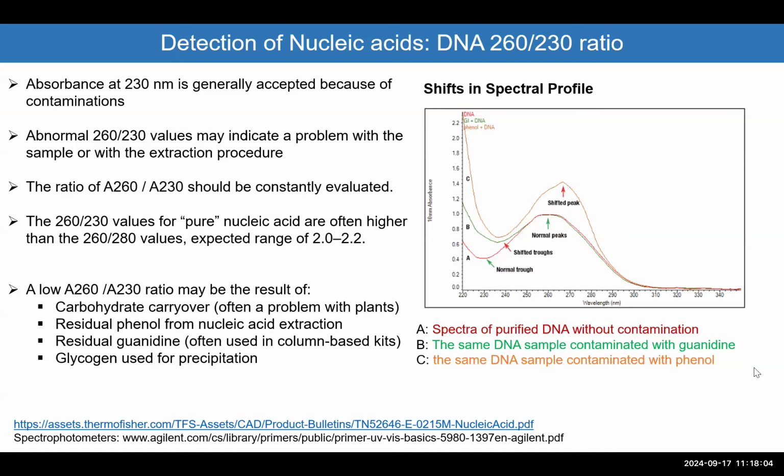So as per today, with the slide information I gave you and the protocols, I'm sure any protocol that comes in your hand with the steps to extract RNA or DNA and check the quality of the DNA and RNA under the spectrophotometer, you will be able for sure to tell if the protocol is suited for RNA extraction or DNA extraction, and whether you will get a good quality RNA or good quality DNA or not.